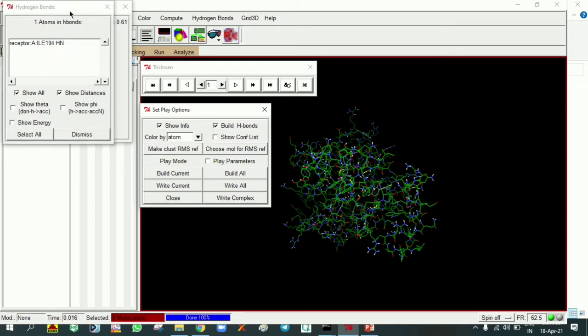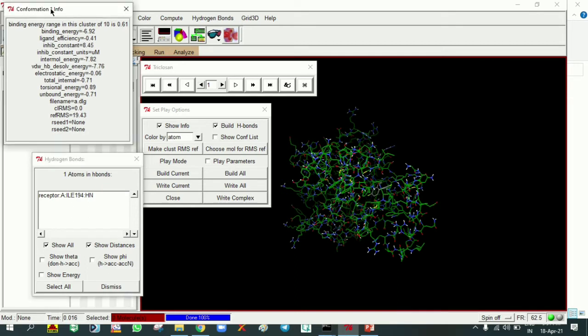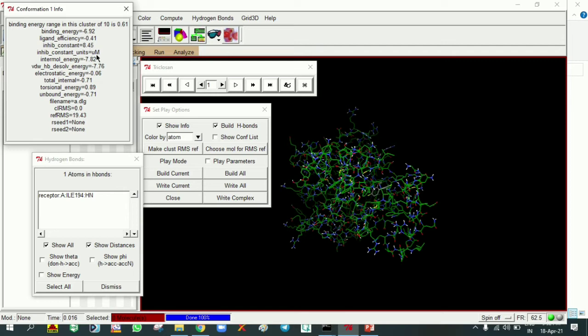It will show the hydrogen bonds and where they are forming. The triclosan is making an interaction with isoleucine 194 and giving the information of that ligand: binding energy or docking score minus 6.92, ligand efficiency, and inhibitory constant Ki of 8.45 micromolar. This is conformation 1. We can check the 10 conformations one by one by clicking the arrow mark.